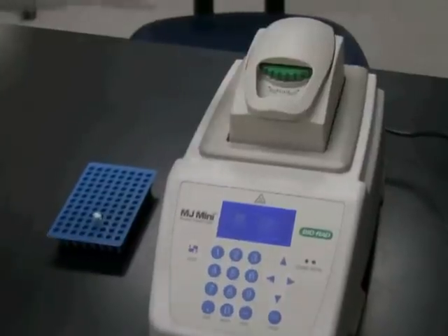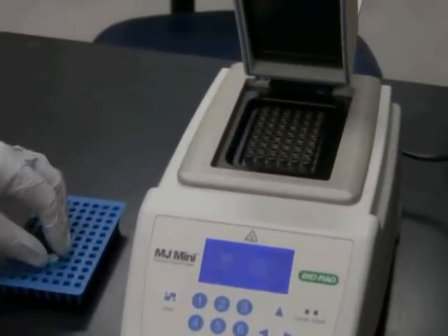The PCR mix is ready. Let's put it in the thermal cycler and run the program that we just prepared.